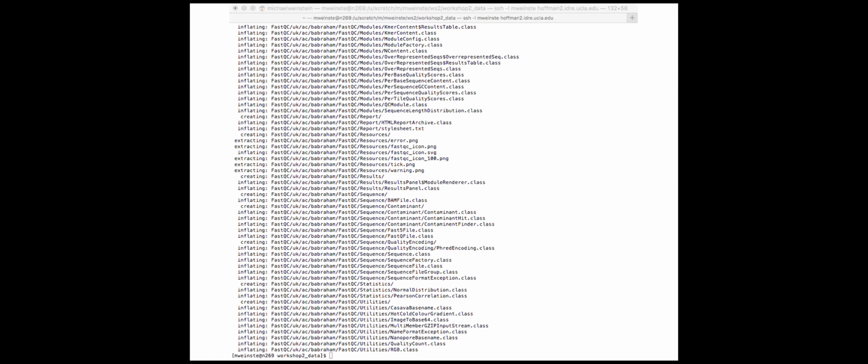So the command to unzip is actually just unzip. So a pretty standard pattern in Linux is that some of the commands are intuitive, like unzip. And the nice thing is most of the time you'll give a command and then you'll just give a file name to work on, or you'll give some options for how to do it. So in the case of unzipping, the command is just unzip and then the file name.